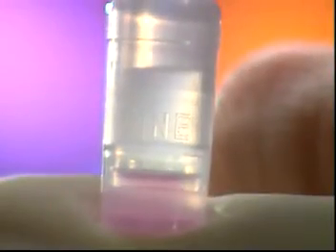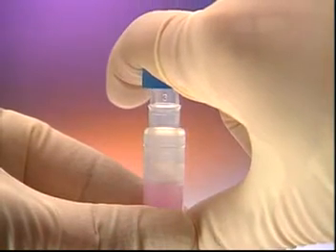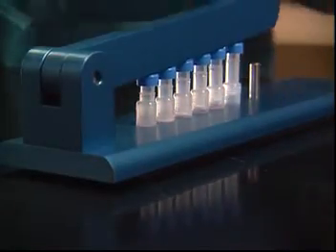The filtered sample is now ready for HPLC, three times faster than with traditional methods. Samples can be compressed individually by hand for small numbers of samples or with a hand compressor for medium numbers of samples.